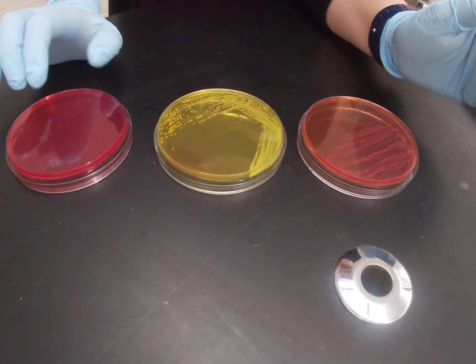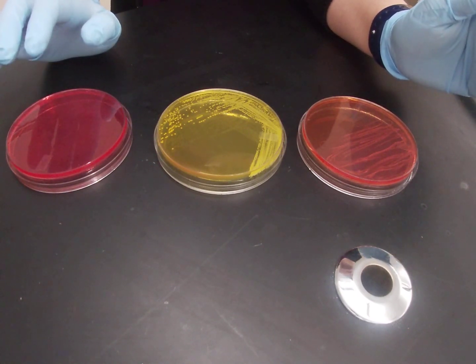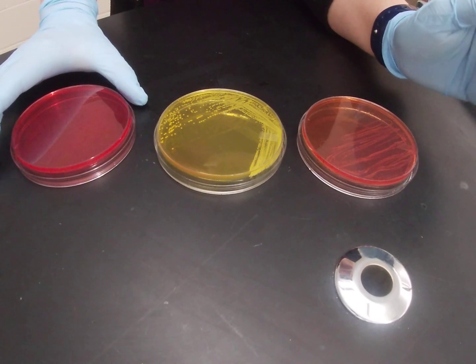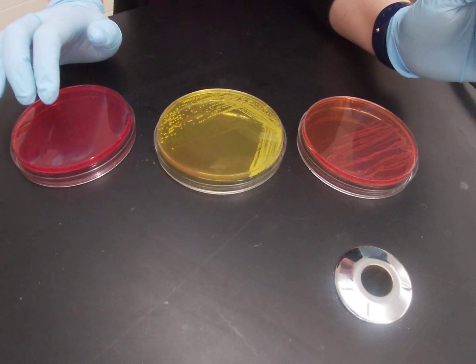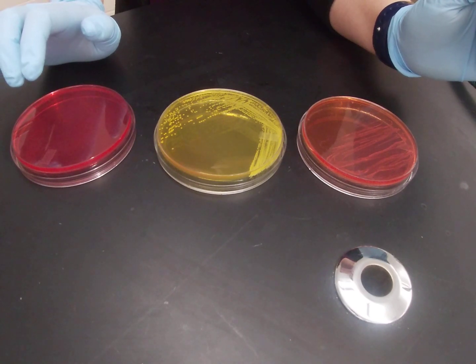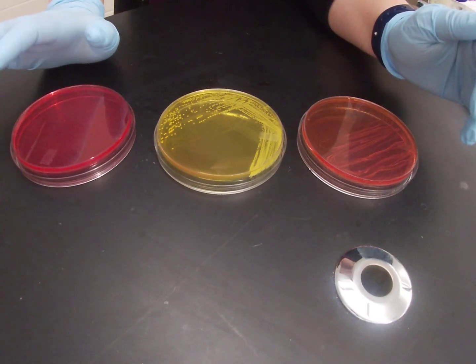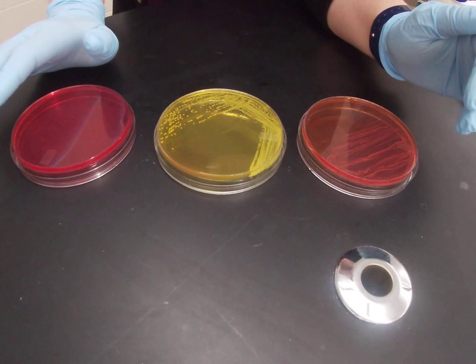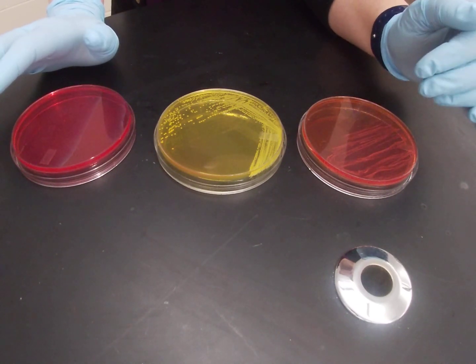Mannitol salt is both selective and differential. It's selective for gram-positive halophiles and inhibits the growth of gram-negatives, and it's differential based on mannitol fermentation. Mannitol salt agar contains 7.5% sodium chloride, which is a really high salt concentration. That salt concentration is inhibitory to all of the gram-negative bacteria we work with in this lab, and it's also inhibitory to a lot of gram positives, especially those that are very fastidious — things like the streps. They're not able to grow on mannitol salt agar because of that high salt concentration.